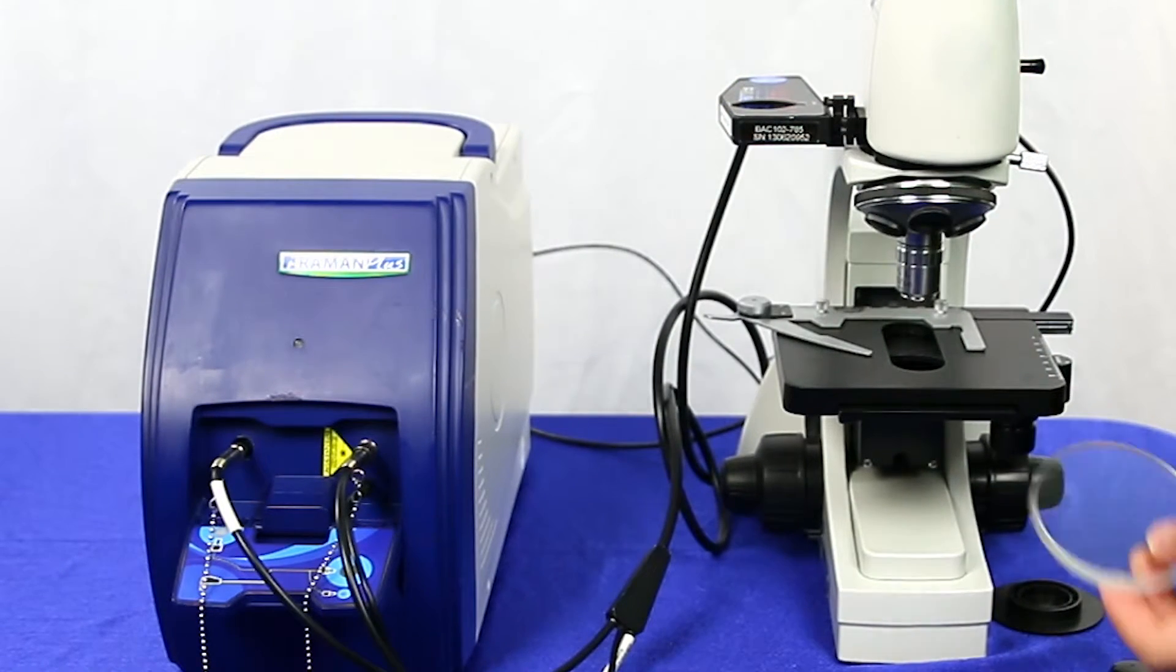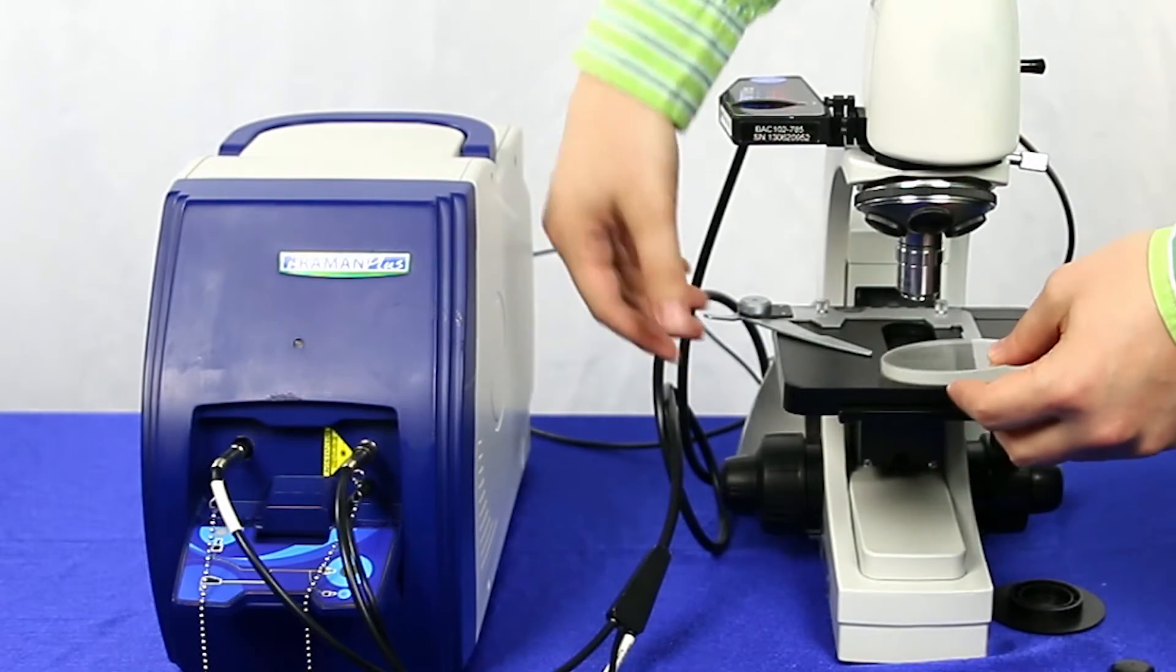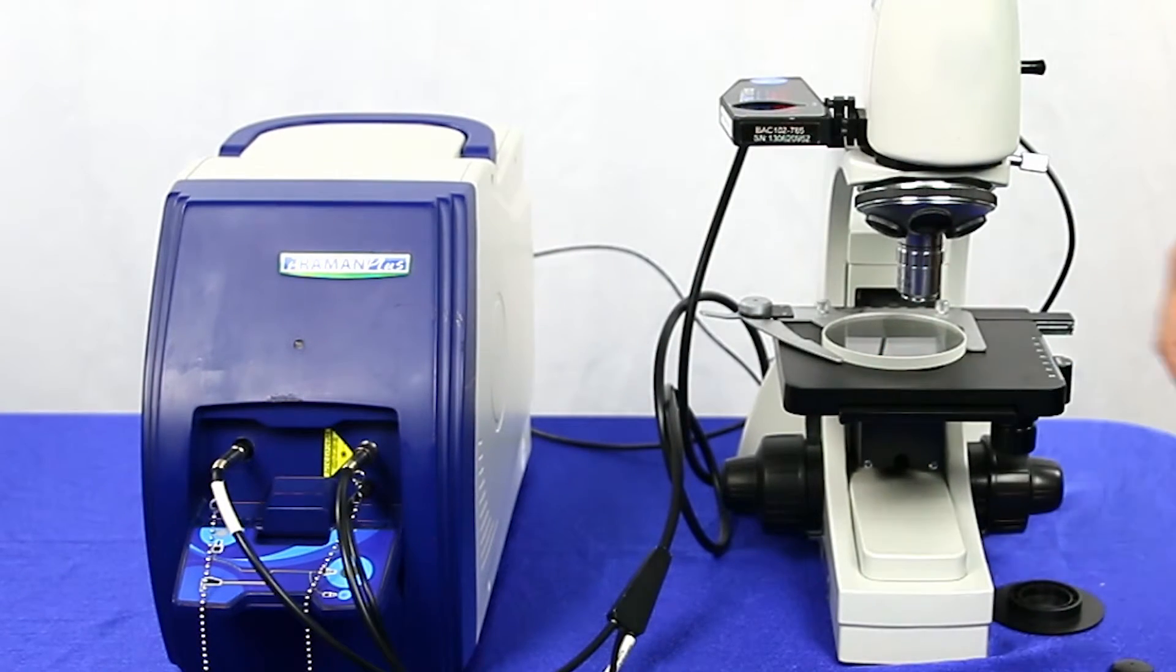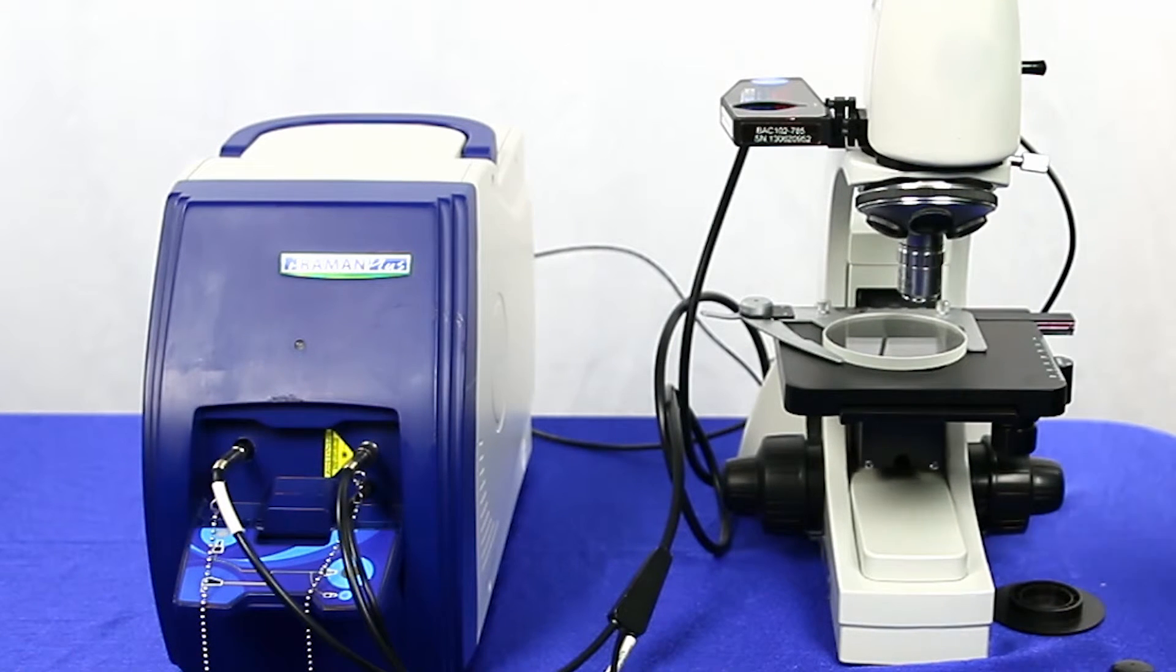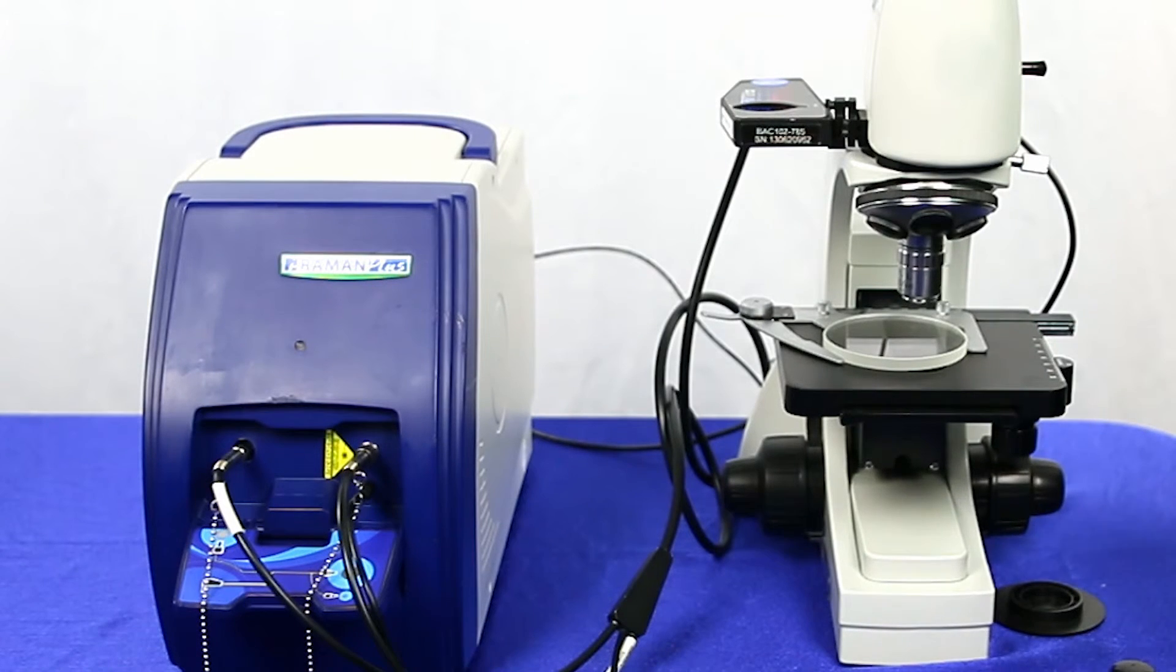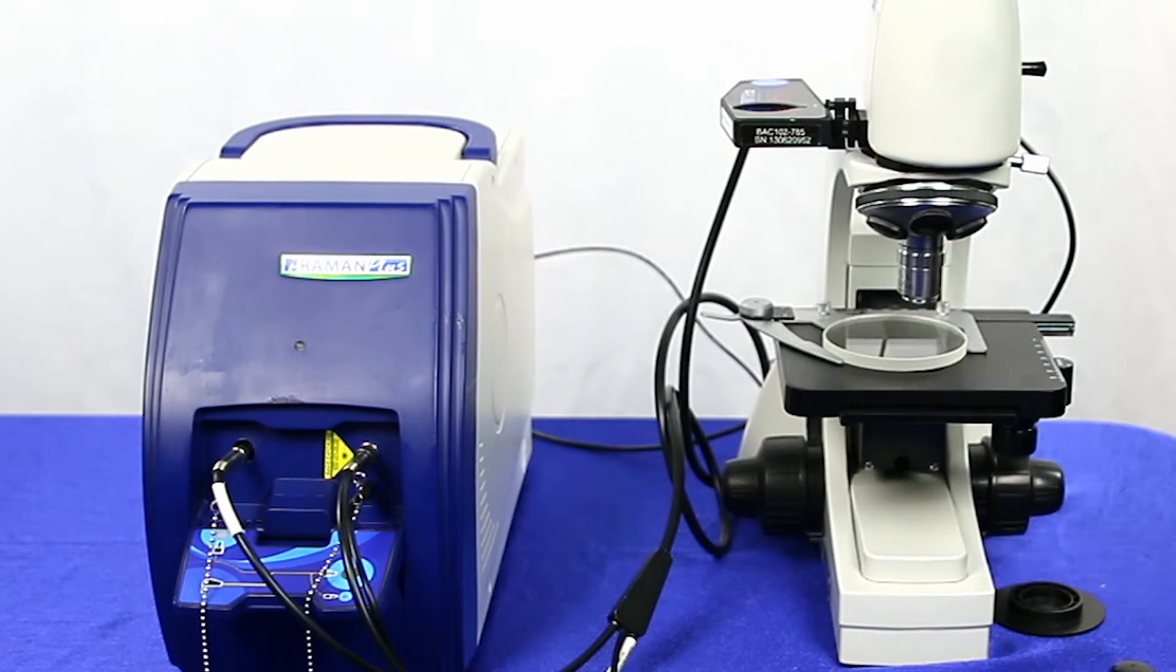You'll also want to put on your sampling stage, your glass plate for your samples. That is how you set up a BAC-151B. We will also have another video to detail how you connect it with your computer. Thank you.